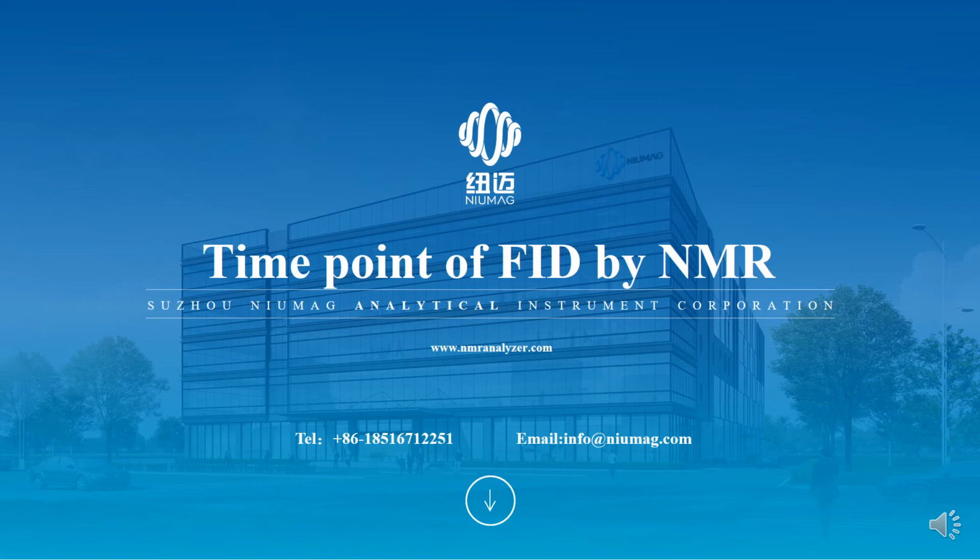Hi everyone. Today we will talk about the timing of the FID signal received by NMR, and we will focus on two parts. One is the dead time of the MRI instrument, which is related to the instrument hardware and it determines the initial position of the instrument to acquire the effective signal. The other is the combination of our corresponding pulse sequence to obtain the signal at the corresponding time, for example, setting the echo time of the corresponding sequence. This part is mainly related to the purpose of our experiment.